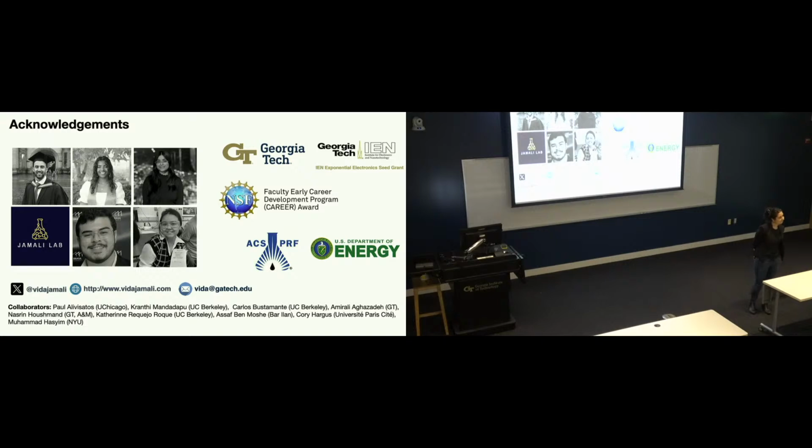Thank you for the talk. I have a question about how you find these samples. Is there a lot of them in a relatively large volume, and you just randomly see something and say, okay, this is interesting, let's see what it is? The sample that you load into the liquid cell chamber is about a microliter, so you can calculate how many particles you should have if you do UV-Vis before the experiment.